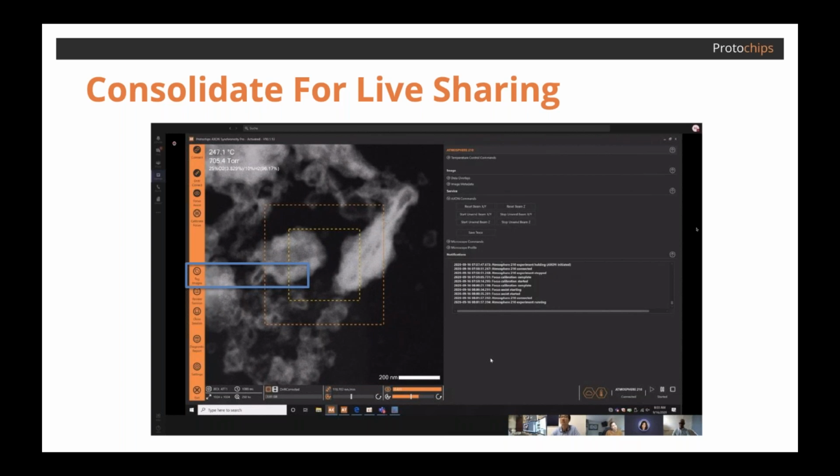You may want to use this when you see something interesting beginning to happen, or if you believe the reaction is about to occur or take place. This will allow you to find this section without needing to dig through data later. You'll also see in just a bit how this drastically improves how data is transferred, since you're cherry picking only what's most important for you.